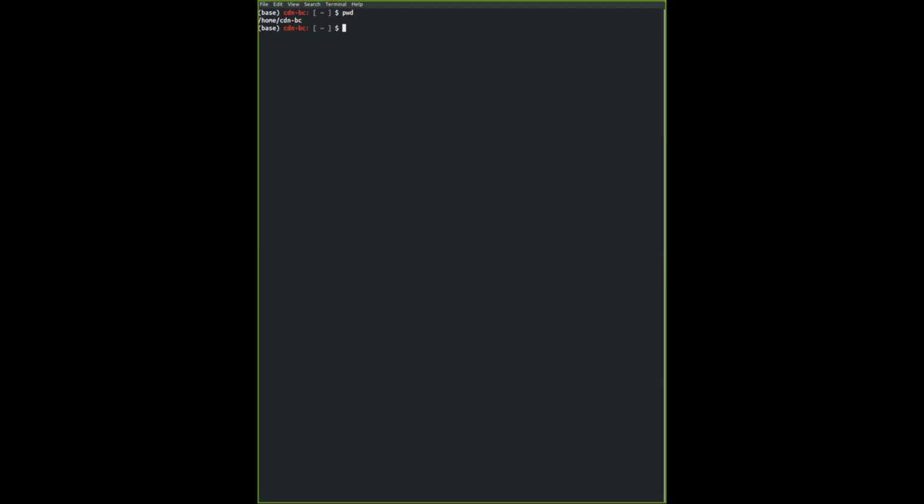Okay, I have a question from Ali. Sorry, so you're saying bash-3.2? That's fine. So the dollar sign that you see right before entering the command is what we call a prompt. This sign tells you that the terminal is ready to accept your command. It will change depending on whether your command is complete or not. But if you see a dollar sign, it's actually good to go.